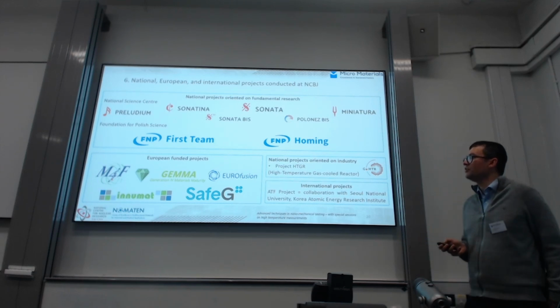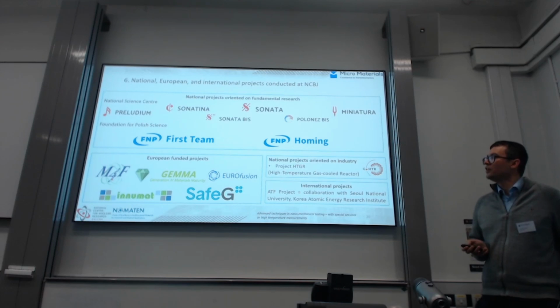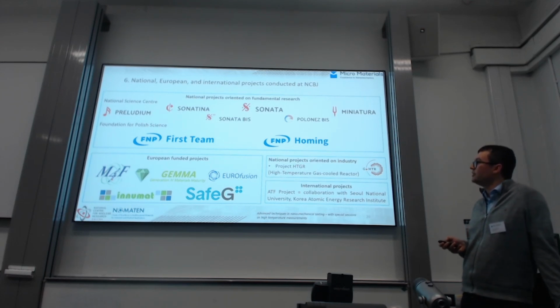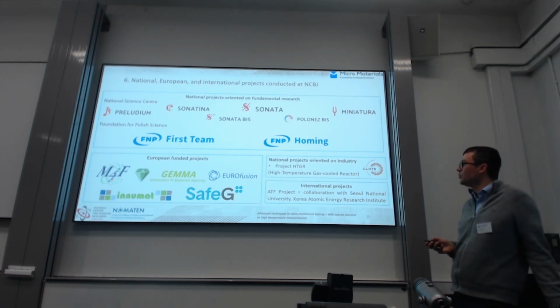And we have quite a lot of European research funded projects where in all these projects we perform quite a lot of nanoindentation, and some more oriented on industry, and especially this one which was started like half a year ago in collaboration with South Korea on the coatings for nuclear reactors.